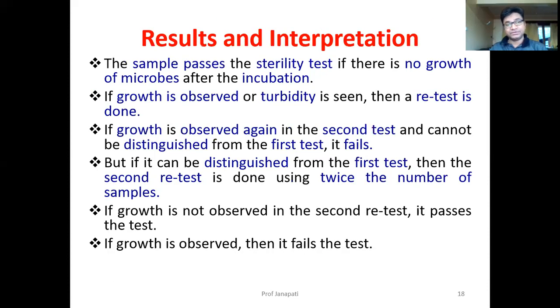Then we are almost finished. So, results and interpretation. The incubation period is 14 days, whereas for media validation the incubation period is 3 and 5 days: 5 for fungi, 3 for bacteria. So here is the results interpretation. You see, the sample passes after 14 days. The sample passes the sterility test if there is no growth of microorganisms after incubation.